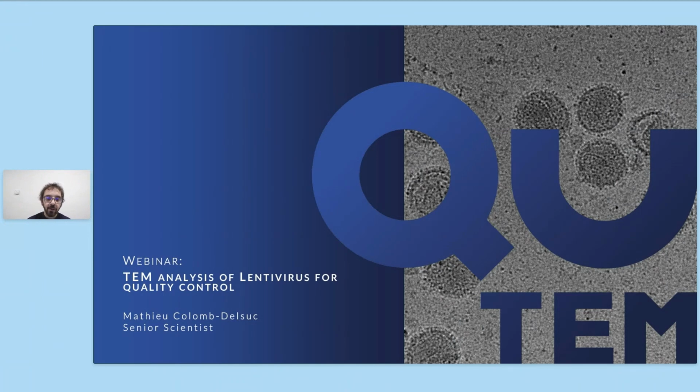So today I will give you a glimpse of the analysis that we are performing at QuTEM using electron microscopy, and the focus of today will be the characterization of lentiviruses. In this presentation, I will first introduce the company QuTEM, after which I will show you some insights onto electron microscopy, so the method preparations that we have internally. And then we will dive into more aspects of the quality control that we have for lentiviruses. And after that, we will have room for questions.